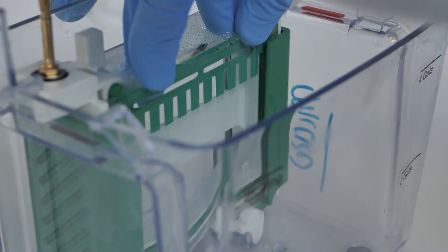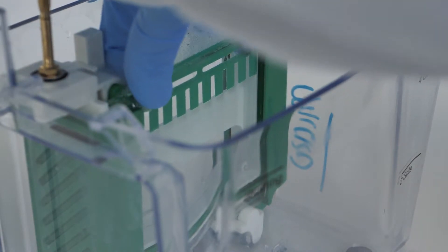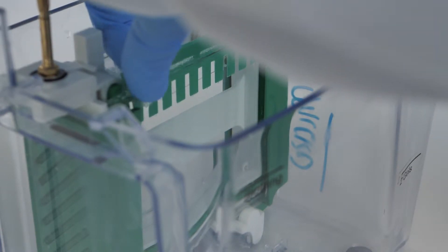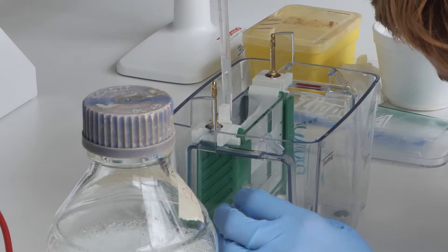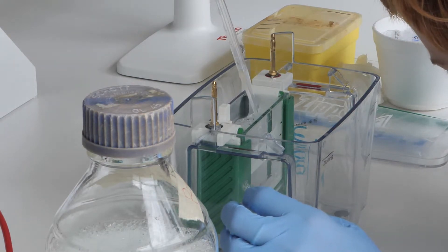Slowly and gently remove the comb, taking care not to rupture the walls of the wells. Wash out the wells with buffer using a pipette before loading samples.